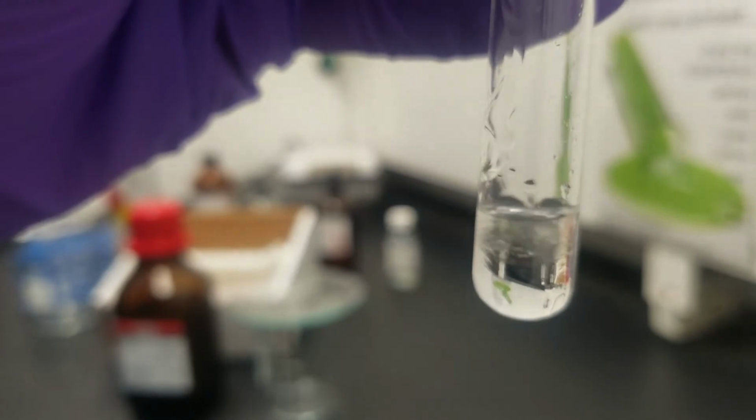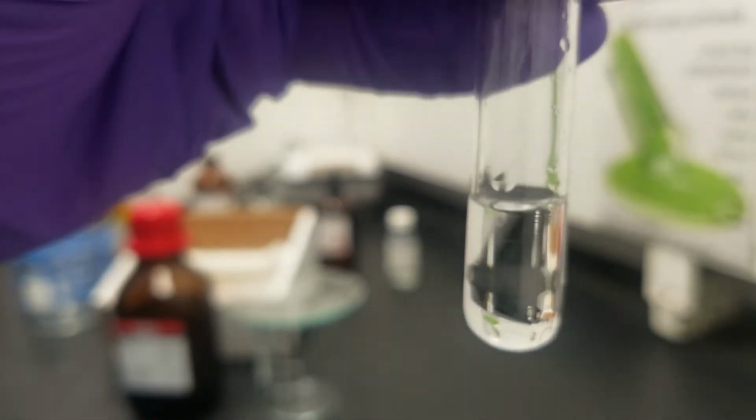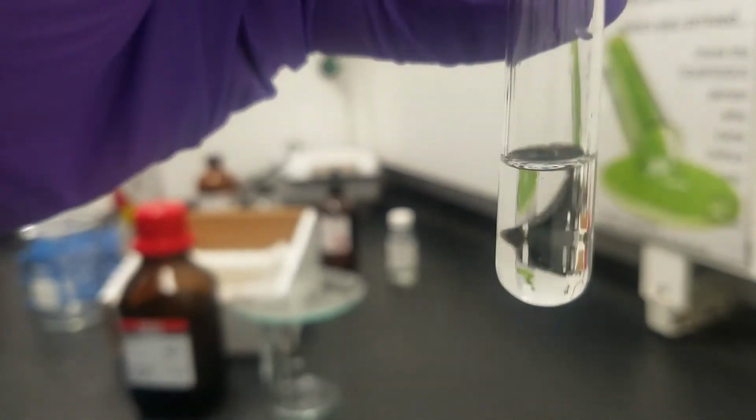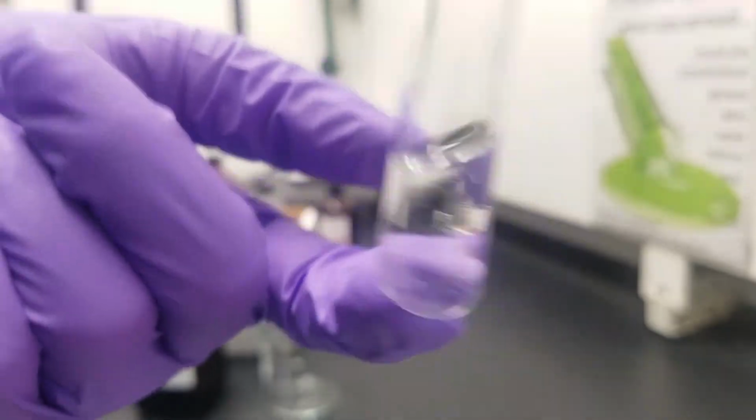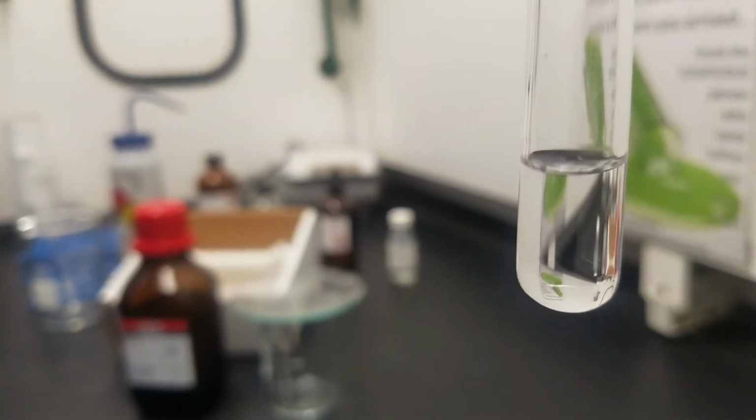And again, we can make our observations. Again, look to see what it looks like at first, then make an observation after you do the mixing, recognizing that it could potentially change. The nice classic example, a snake bite if you're over 21.